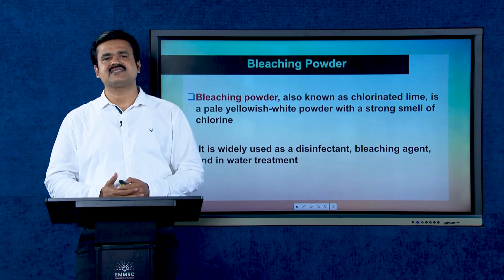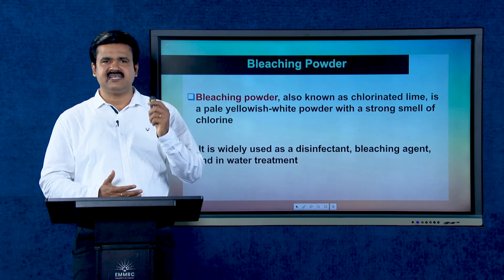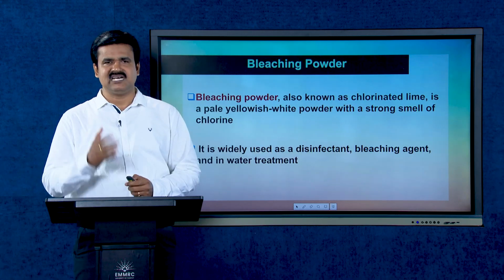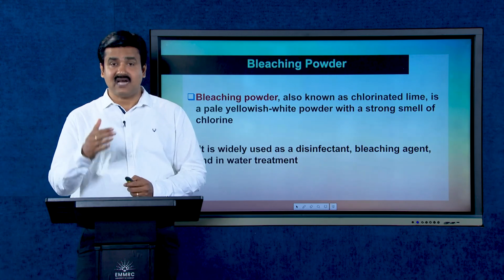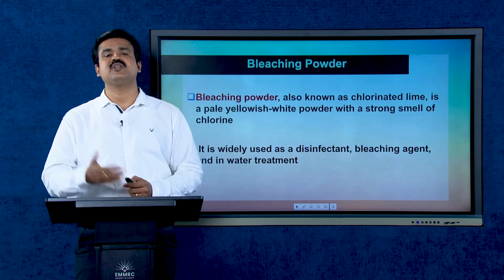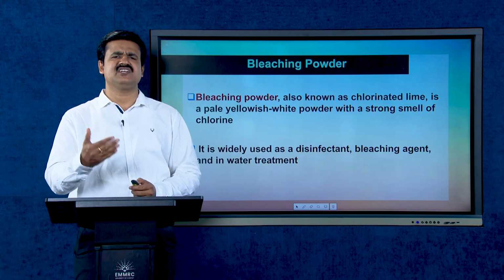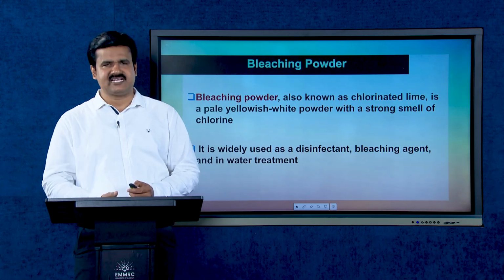It is widely used as a disinfectant, bleaching agent and in water treatment. Remember, bleaching powder is highly useful as a disinfectant for the treatment of water. It has bleaching action. Bleaching action is a kind of oxidizing action.